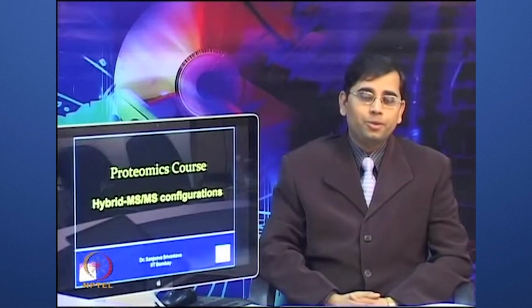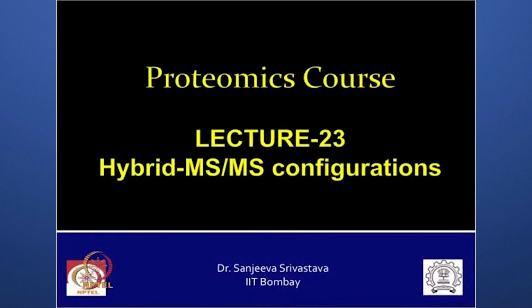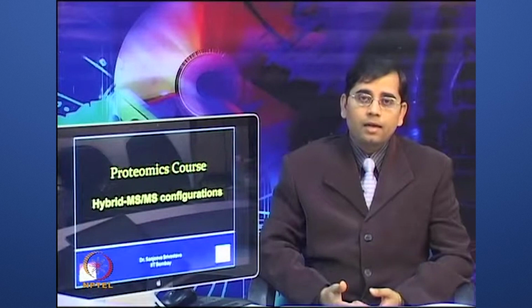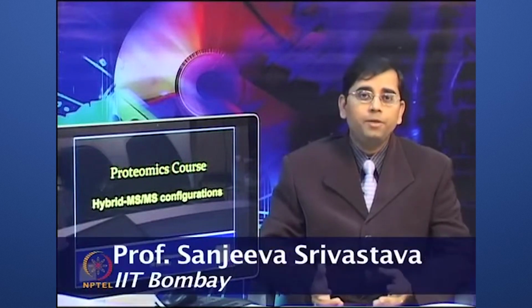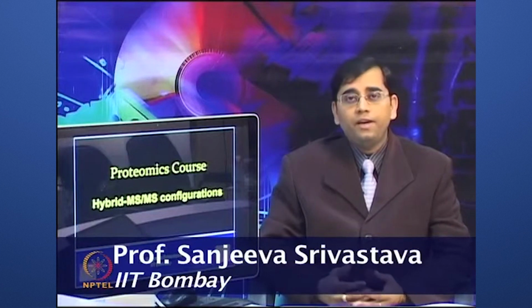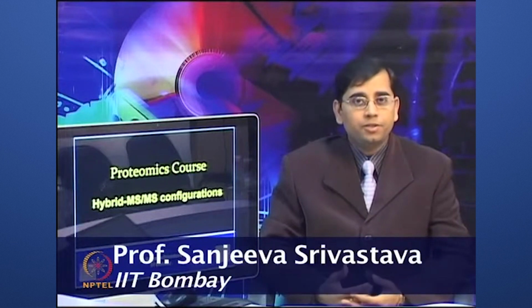Welcome to Proteomics course. Today we will talk about hybrid MS-MS configurations. As we have discussed, there are different types of mass spectrometers available, and depending upon the mass analyzers, how they can be used together, different types of MS-MS configurations, hybrid MS-MS, have emerged.